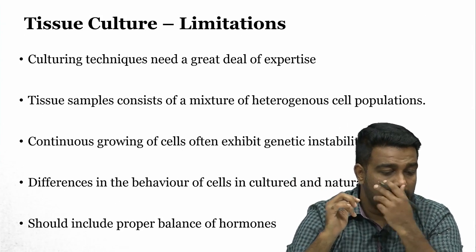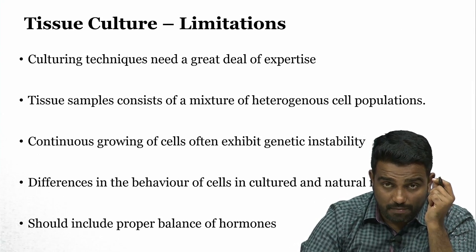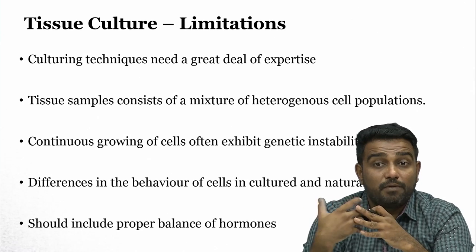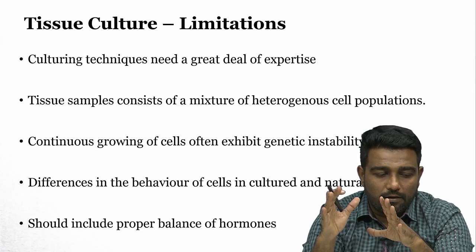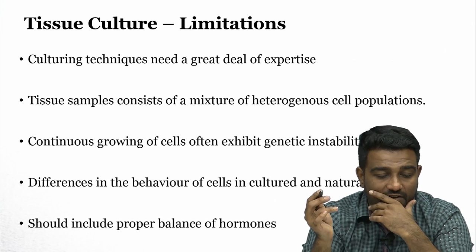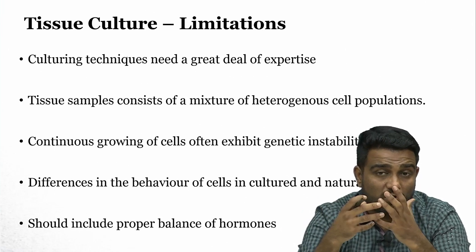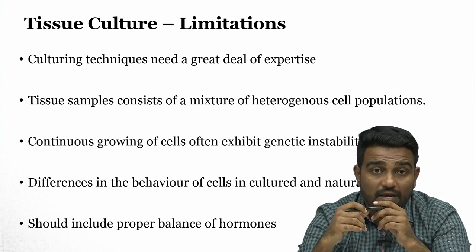So, the limitations are that cell culture techniques need a great deal of expertise. If there is a contamination, if there is a bacterial contamination, cells would die. So, we require a skilled person or skilled personnel to operate the tissue culture laboratory. Okay. So, the culturing technique requires a great deal of expertise. Tissue sample consists of a mixture of heterogeneous cell populations, because you can have different cells and you want to grow a tissue out of it. Continuous growing of cells often exhibits genetic instability.